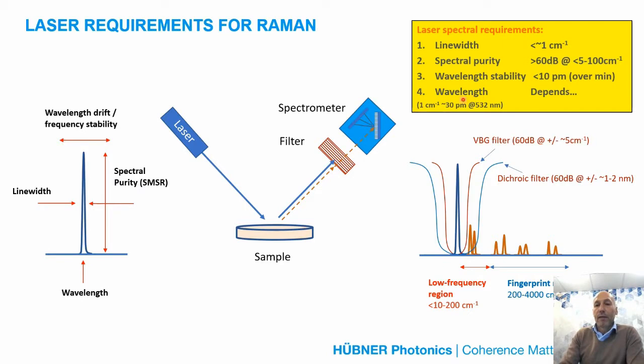Then finally we have the wavelength. Where should the laser emit? And that depends on many parameters.